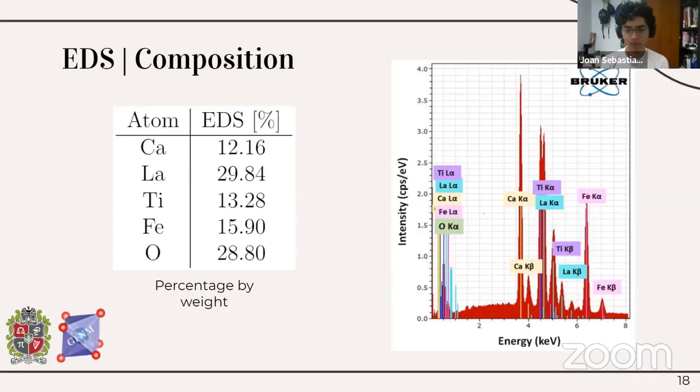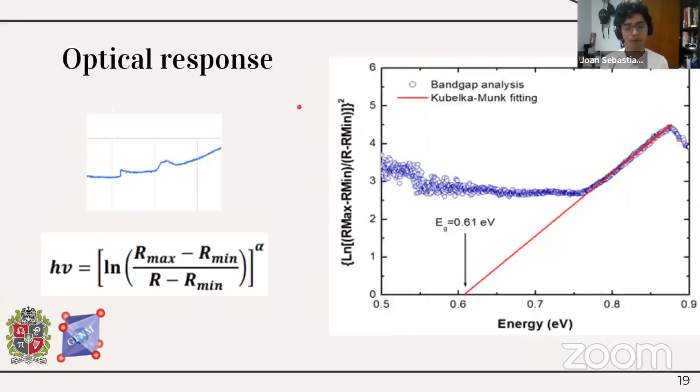In this case, given that we are working with oxygen, which has an atomic number of 8, it is possible that it was overestimated or underestimated, and that difference was shown in the lanthanum as well. We also found some aluminum in our sample, and we believe that, given that we were working with alumina crucibles, it is also worth noting that that could be a source of contamination.